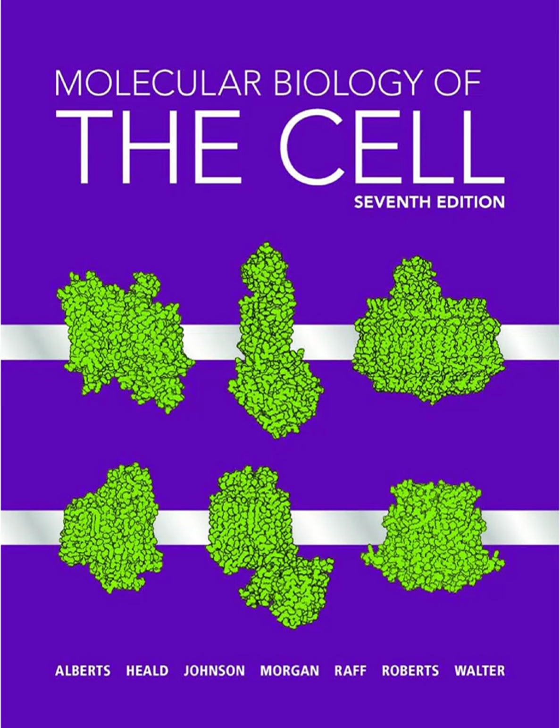Cool. What about proteins? For proteins, the workhorse is immunofluorescence. This uses antibodies, which are proteins our immune system makes to target specific things, right? Highly specific. Incredibly specific. Each antibody recognizes a particular target molecule, its antigen. So you can generate antibodies against almost any protein you're interested in.